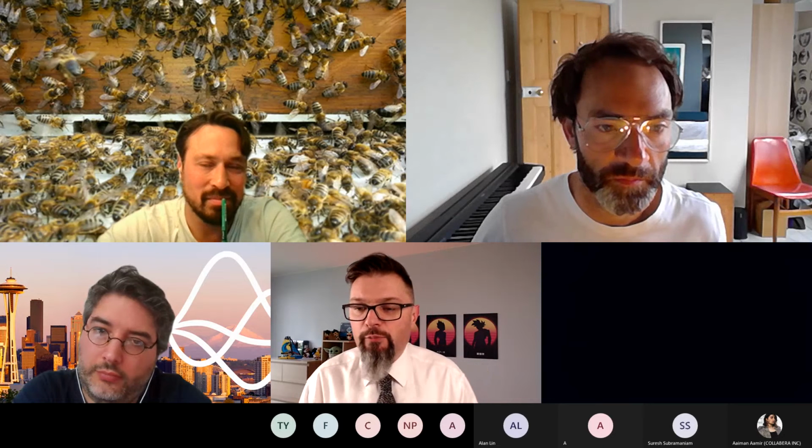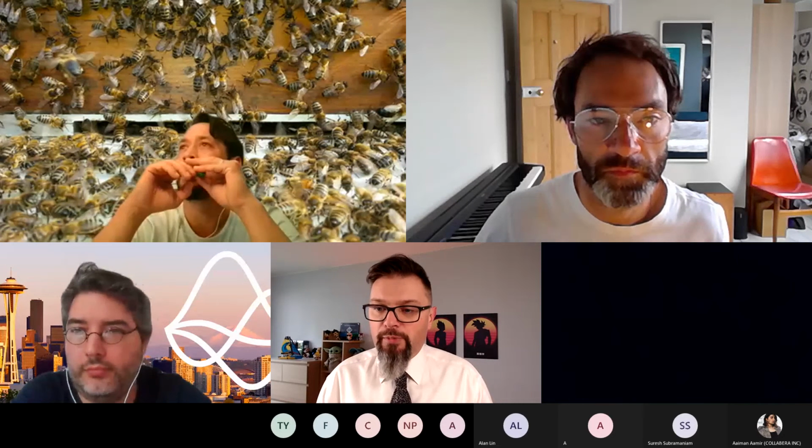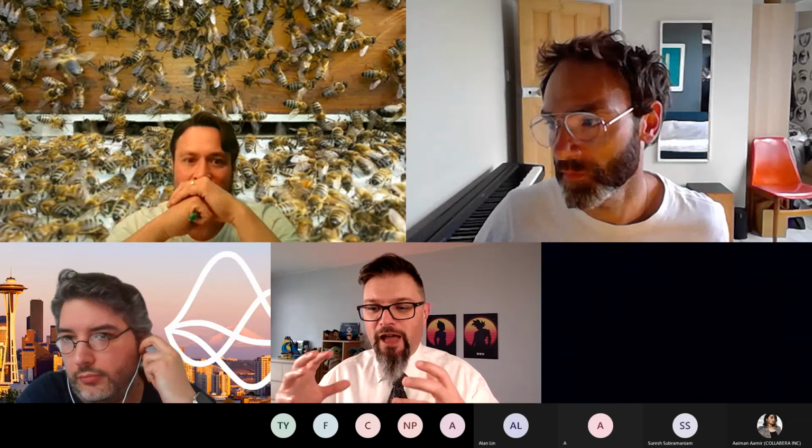So it's the next step, the direct next step, and we are very excited to try to implement stacking, because it's a challenge. It's not just a matter of having more and more data. We need to adapt the way. So Jonathan just shared about Faster R-CNN, TensorFlow, but we need to have a different approach to have that kind of 3D, the stacking.